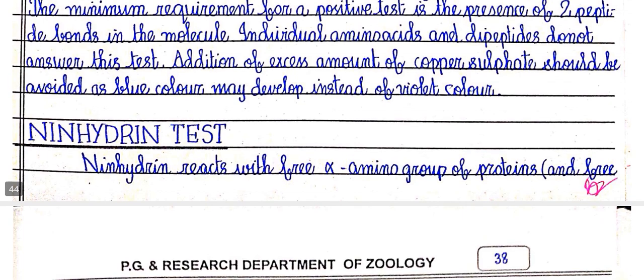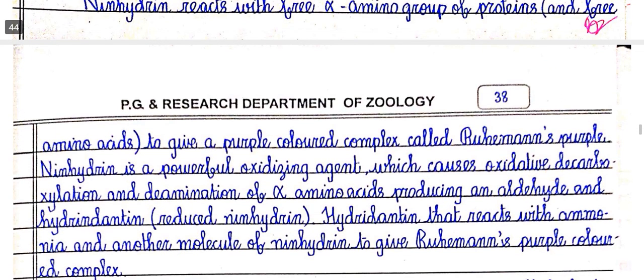The next, ninhydrin test. Ninhydrin reacts with free alpha amino groups of proteins and free amino acids to give a purple colored complex called Ruhemann's purple. I'm not sure about the pronunciation.